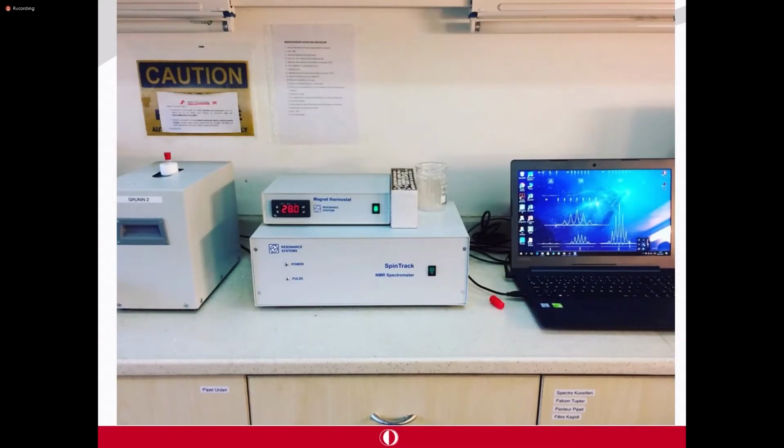So that is why, for instance, the system can do solid fat content measurements in a very accurate way, or we can work with solid samples like powder samples easily with this nice homogeneous magnetic field, because the higher the homogeneity of your system is, the better signal you will obtain, and a better signal will give you better results in terms of interpretation.